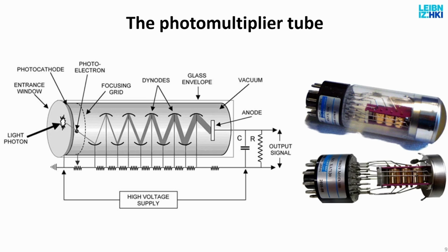And this is from a group of metals where the electron at the most easily excitable level is so easily excited that a visible light photon hitting the metal will kick out one electron from the metal. And then you have an electron hanging out here with nothing to do. So what you do is you put a second electrode here, and you put a large positive voltage in there. The electrons are attracted like that, so they will accelerate toward their new home here, and as they accelerate, they gain kinetic energy. So now they have more energy than they had before.